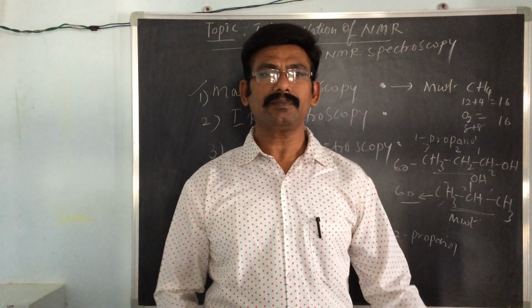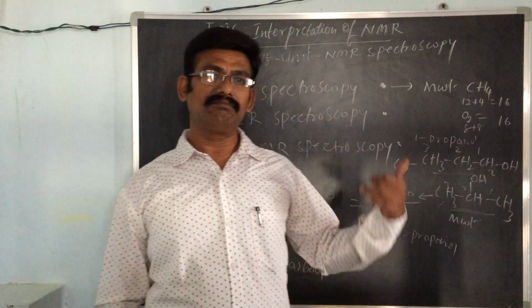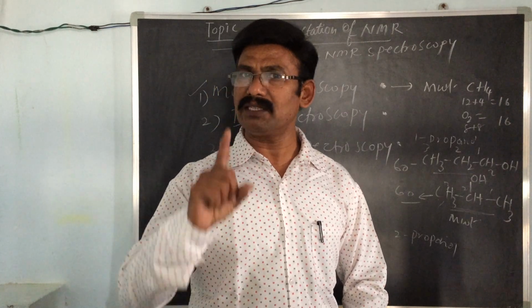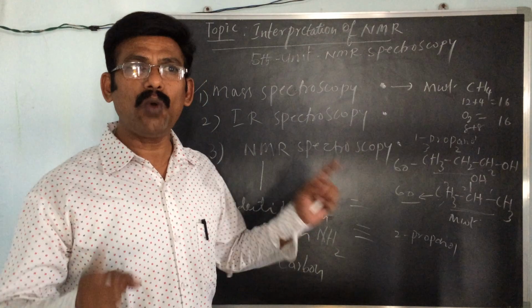Both carbon as well as proton. So two types of NMR are there.